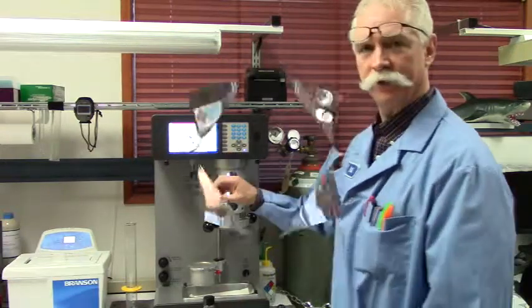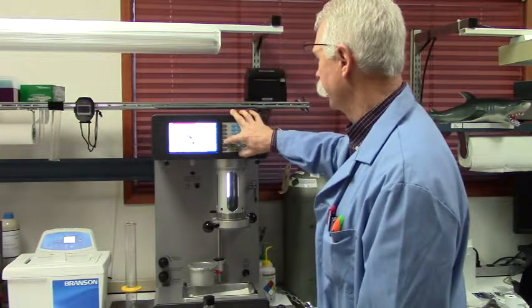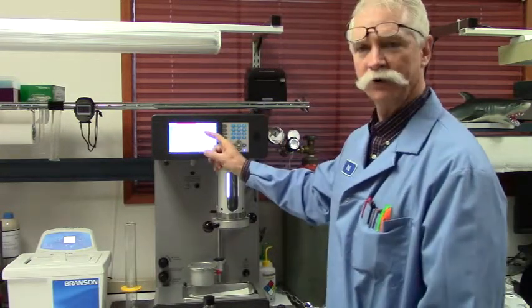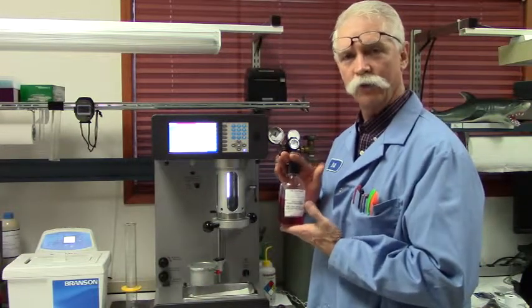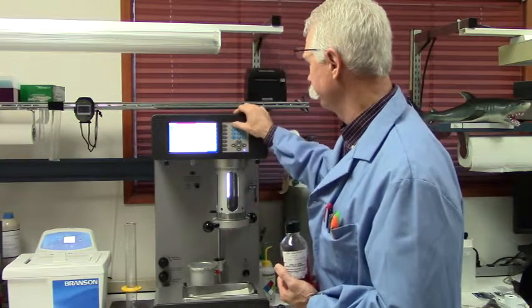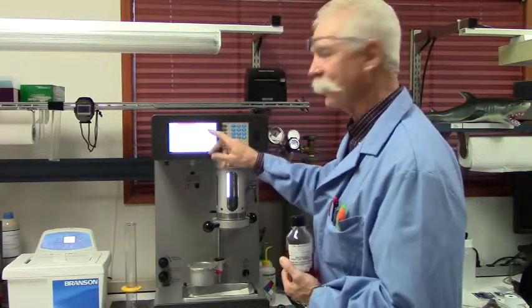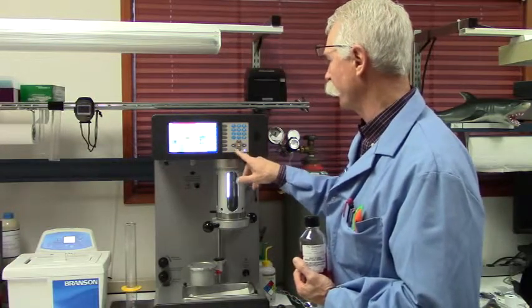First thing we want to do is set up the instrument. We're going to go to the sensor setup and select the proper calibration for the type of fluid we're going to run. We're going to run iso-medium test dust reference fluid, so we're going to select a medium test dust calibration — in this case, number 1. Make sure that all the parameters are set up properly, then go back to the home screen.